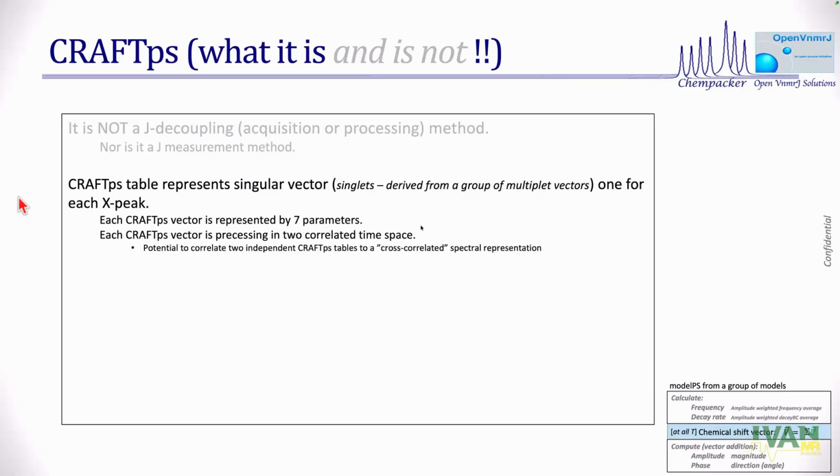That's it. NMR properties, nothing more, nothing less. That's what it represents. How good or bad it is is a different question.